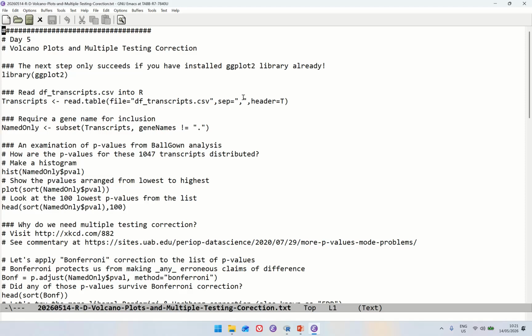We've had a pretty rapid introduction to R here. We spent basically a single day on language basics. We looked at doing jitter plots as an alternative to dynamite plots and also box plots, very valuable. Yesterday we looked at MA plots for looking at biases in signals between our cohorts. But today we are proceeding to the classic example of differential gene expression plotting, which is the volcano plot.